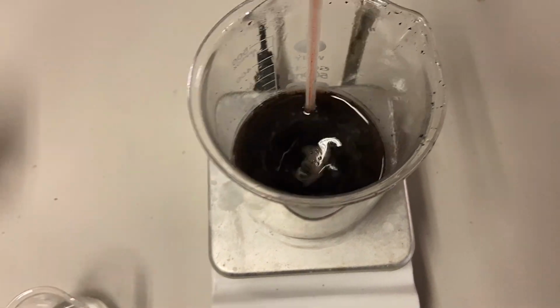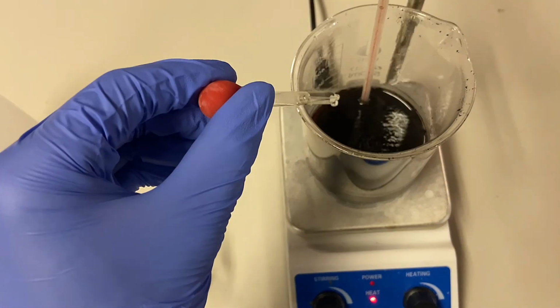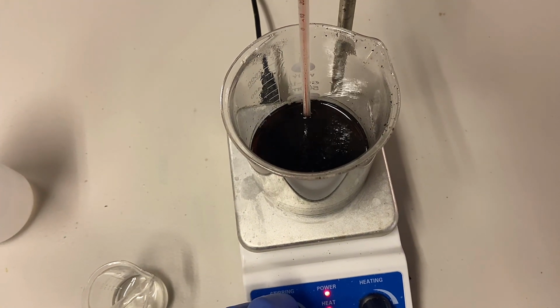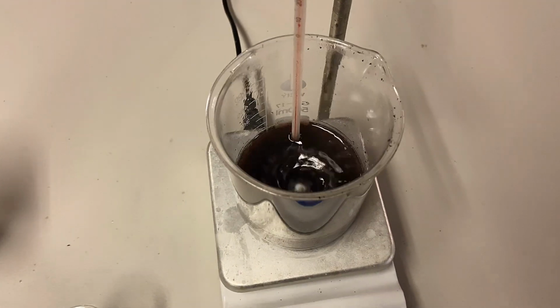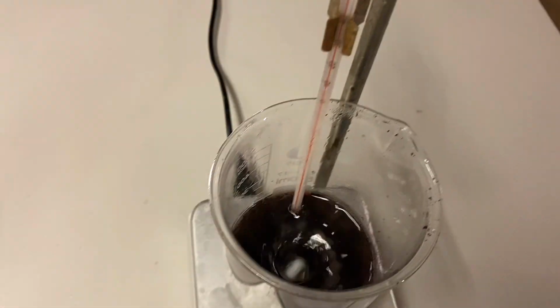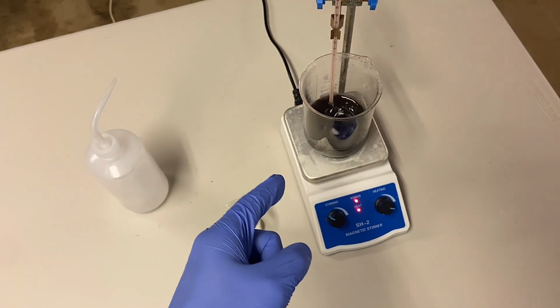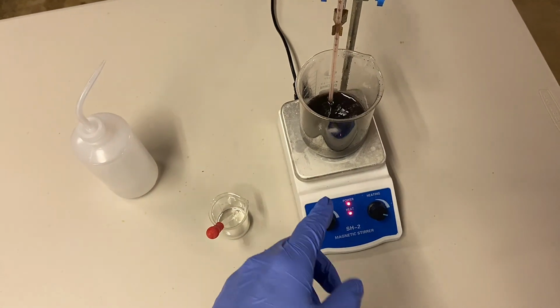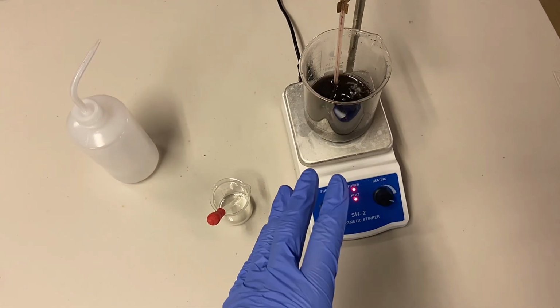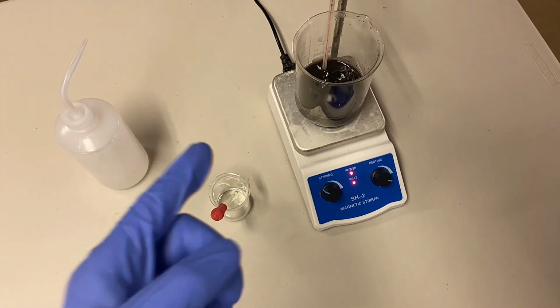But overall, I'm adding small amounts, just drop-wise, of hydrogen peroxide, which should serve as a little bit of a booster for the acid in there. And that should allow it to really dissolve quite rapidly. And I'm bringing the temperature up to 95 degrees, just below boiling, which again will increase the speed and power of the acid. But for now, I'm going to leave this to sit for a good couple of hours, dissolve as much as I can, filter it off, and then we're going to start doing the manganese extraction. So it should be a pretty interesting video today. Hopefully I actually get it right and don't mess something up, but I'll check back in a couple of hours.